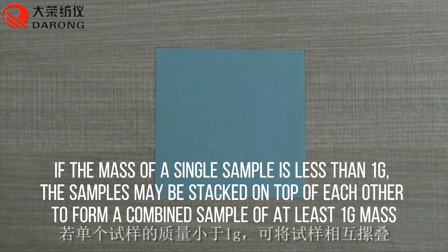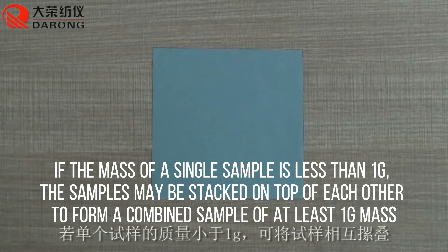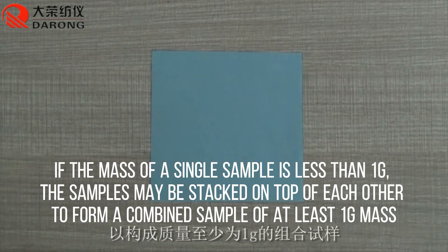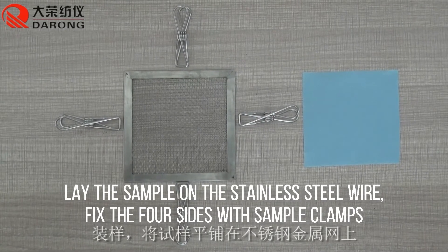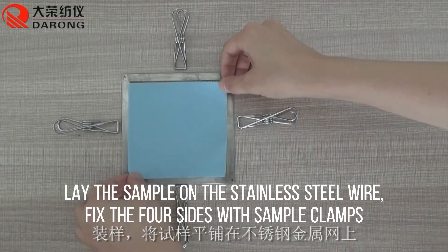If the mass of a single sample is less than the required amount, samples may be stacked on top of each other to form a combined sample of at least the minimum required mass. Lay the sample on the stainless steel wire mesh and fix the four sides with sample clamps.